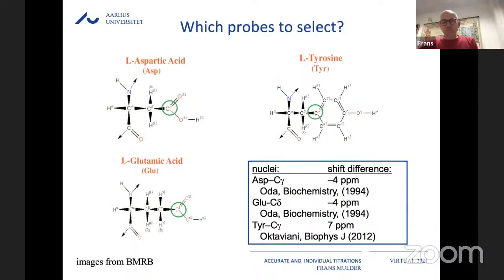So in order to get resolved two-dimensional spectra, we need to have some form of 2D NMR. And the most sensitive way of doing 2D NMR is connecting a proton chemical shift to this carbon chemical shift in the ring. Now, if one wants to observe this one, this is the one that actually will change the most, so this is the ideal one to be looking at. The protons that you have to correlate it to are these epsilon protons. However, what happens if this ring starts flipping?